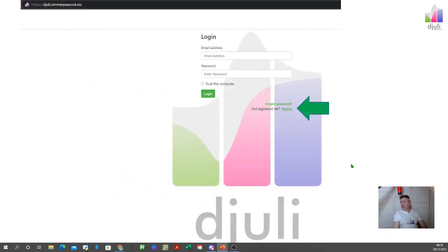So let me just finish by saying djuli is very scalable. Literally, it is just a web page with a sign up, at which point you can log in, start creating clusters and projects and inviting other people, or you're using it yourself and inviting internal collaborators and external collaborators to also use the system as well.